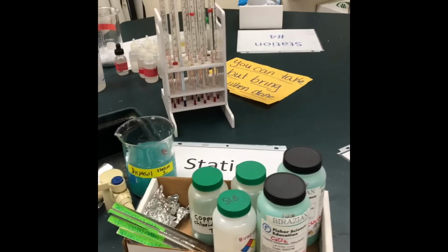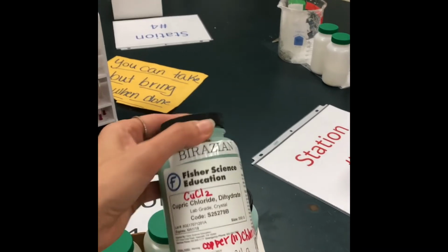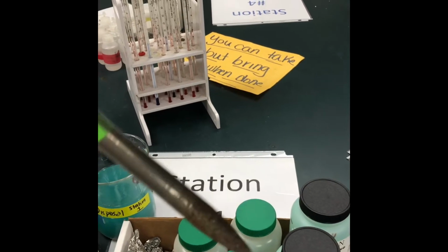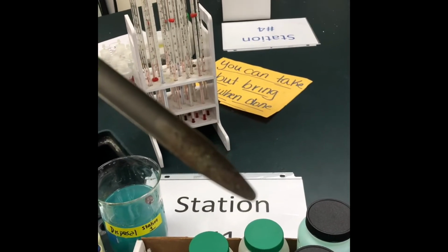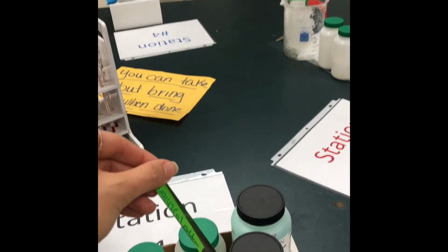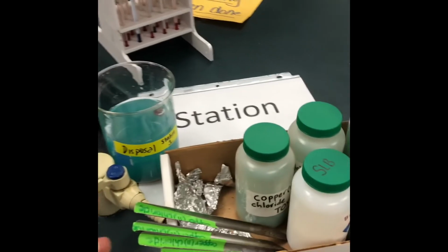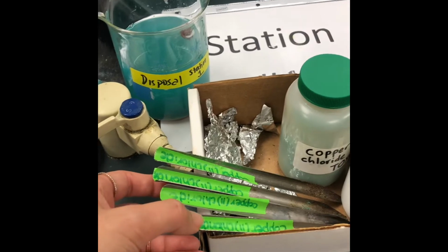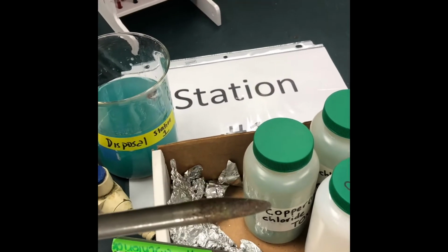Some things I'd like to say about station 1: you're using a compound called copper(II) chloride, seen here. Copper(II) chloride reacts with metal, and if you look at the spatulas that I put here, you can see how the metal has started to corrode and react. So it's really important that you don't leave the spatula sitting in the chemical. Rather, recap all the bottles, okay? Because it reacts so violently with the metal spatula, I have set aside a few designated spatulas that are labeled that you should use. Again, look what it does to your metal.